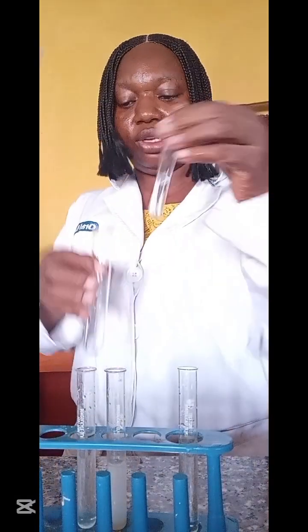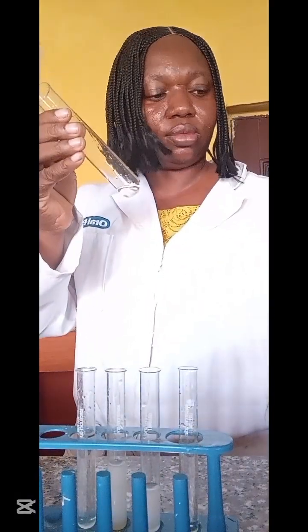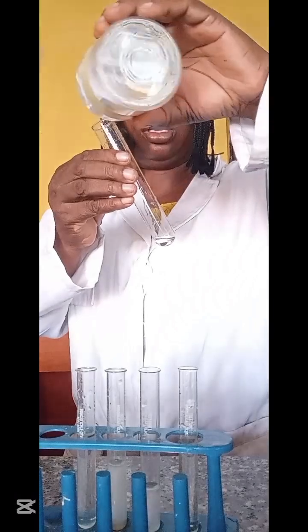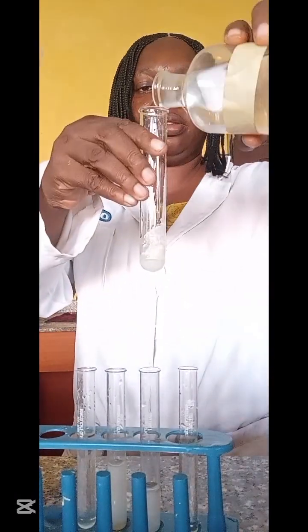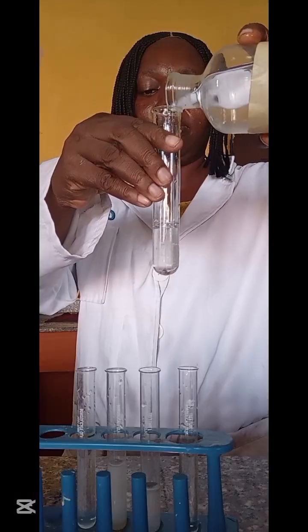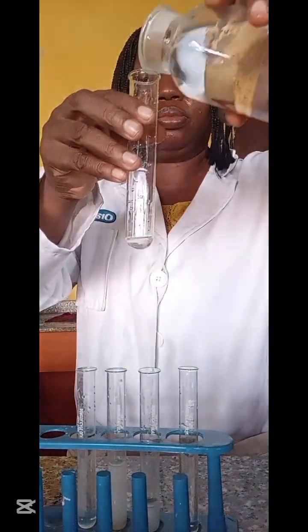Let's check the second one. So this is aluminium solution. Sodium hydroxide. In drops, gelatinous. In excess, soluble. You see? So this is aluminium.